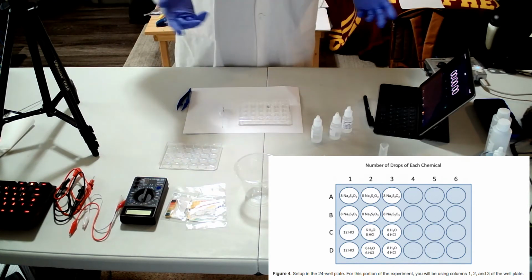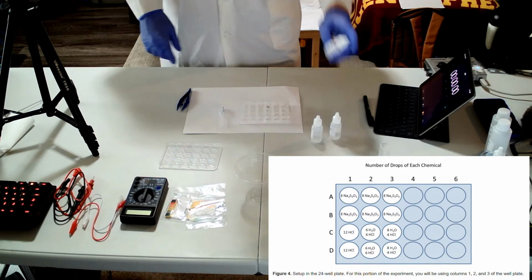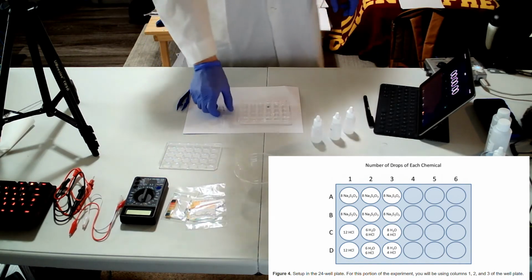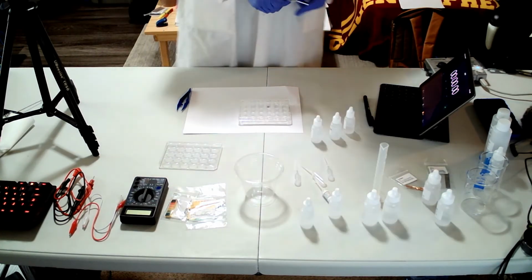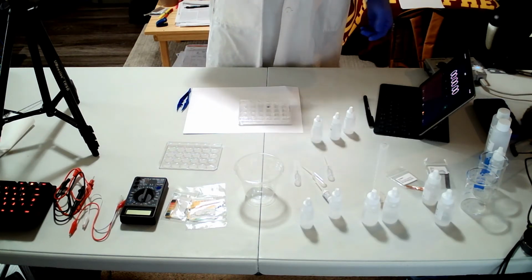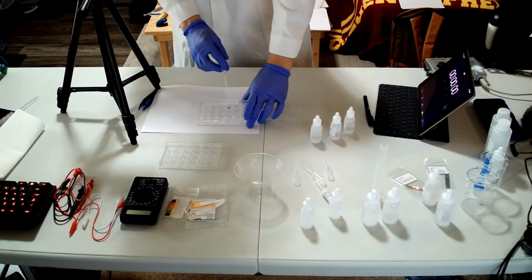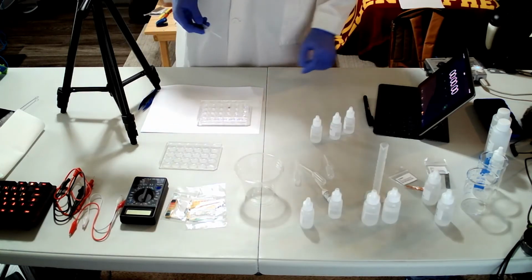So basically all of them are clear. It is important to track that I have all the solutions. After filling all of those, it is ready to mix row A to C and from row B to D. So let's see the next step. When the X here disappears, then the reaction is done.